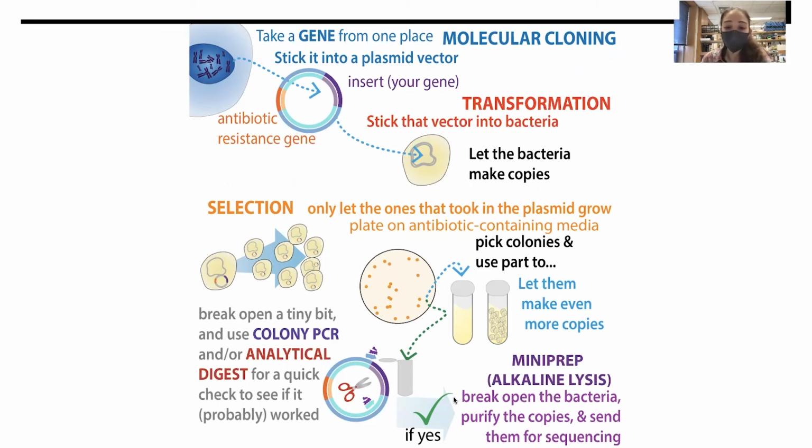If you want to be really sure, you're going to want to send your clone for sequencing. But at least now you have a better idea that there's probably an insert in there. I hope that helps you weed out and reduce the amount of work you have to do to get to the really fun stuff, playing around with the protein products.